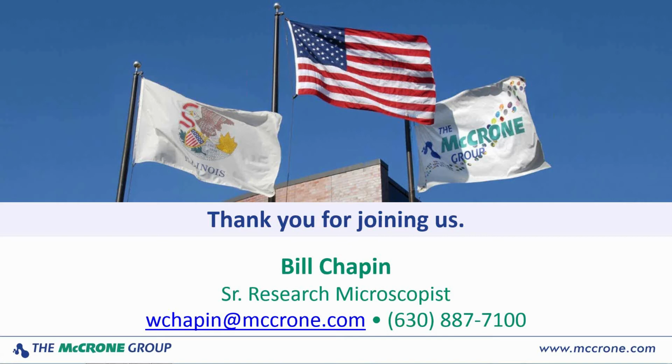Hello, Troy. How you doing, buddy? What's the cost difference between standard stereo and coaxial? Don't know, Troy. I'll get back to you on that. I can tell you that my system is probably 25K, the stereoscope that you saw with all the whistles and bells. So you're probably adding another, I don't know, 8,000 to it or something for the coax.